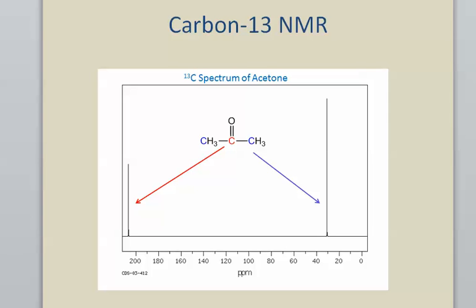Well, most NMR is done by analyzing the proton in hydrogen atoms, but you can actually perform NMR on a variety of different atoms as long as the isotope in question has an odd number of protons plus neutrons. Then generally you can run NMR based on that element. And in organic chemistry, if we're not looking at the hydrogens and how they are connected in molecules, we're looking at the carbons. And so carbon-13 is an isotope on which we can do some NMR, and oftentimes it's done on the same instrument that does the hydrogen.